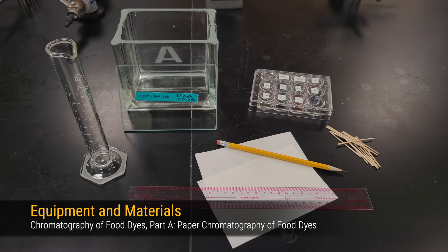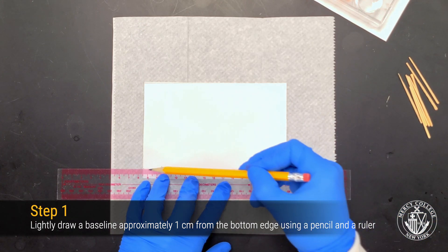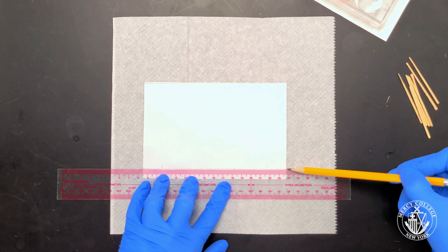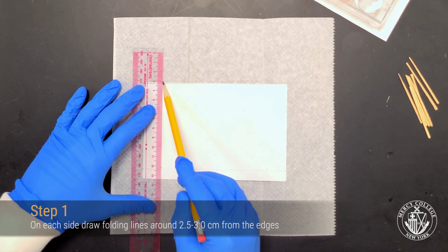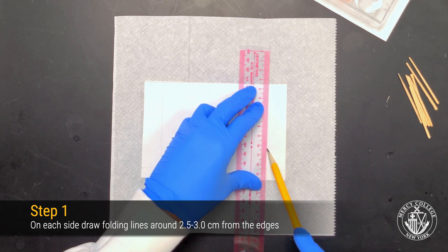Here are some of the materials that we're going to make use of in Part A of this experiment. To begin, select a piece of chromatography paper and draw a baseline approximately one centimeter from the edge of the paper. Next, draw vertical folding lines approximately two and a half to three centimeters from both edges.